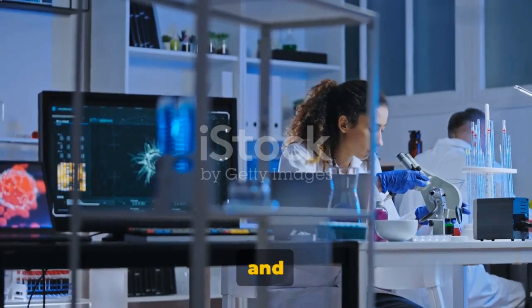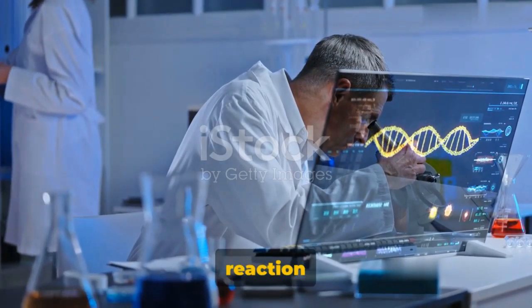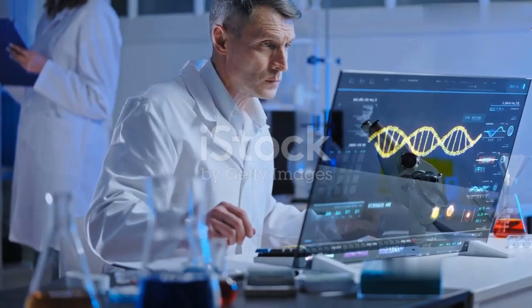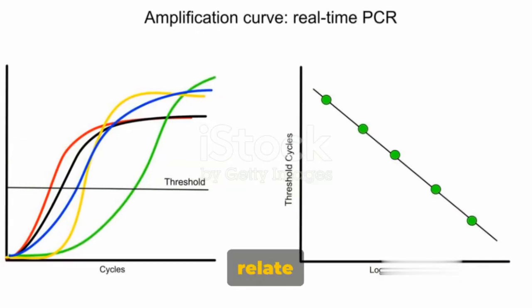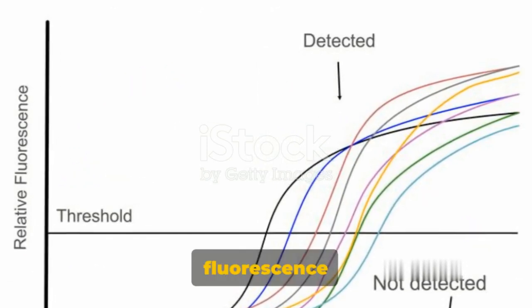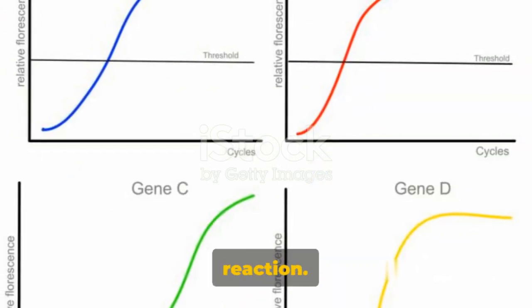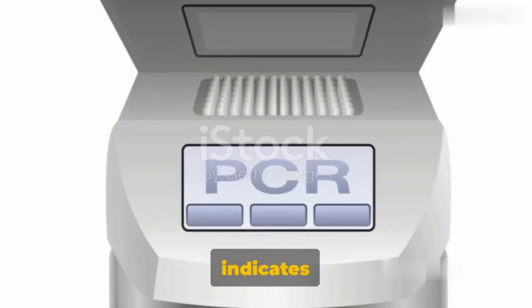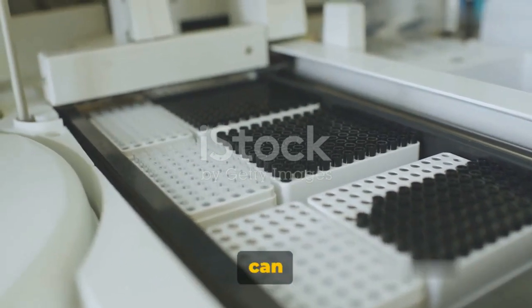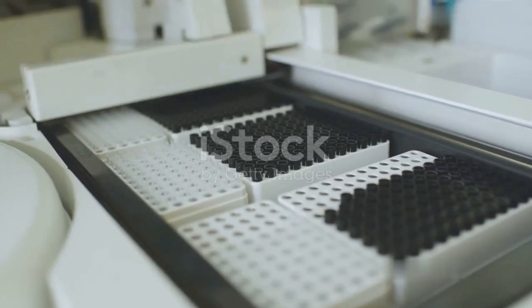It's all about the detection and understanding of the fluorescence produced by a reporter molecule. As the PCR reaction progresses, the fluorescence increases, providing us with a real-time insight into the amplification process. But how does that relate to the amount of PCR product? Well, the key is in the correlation. The fluorescence is directly proportional to the amount of PCR product at each stage of the reaction. This means that a higher fluorescence indicates a higher quantity of PCR product. By monitoring this fluorescence, we can quantify the DNA, cDNA, or RNA in our sample with great precision.